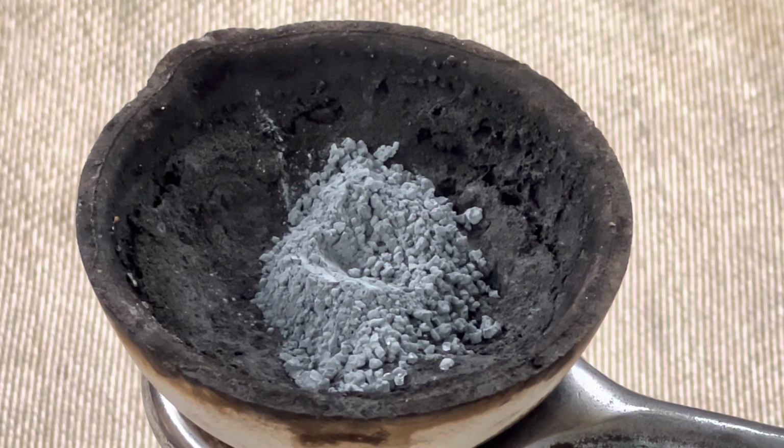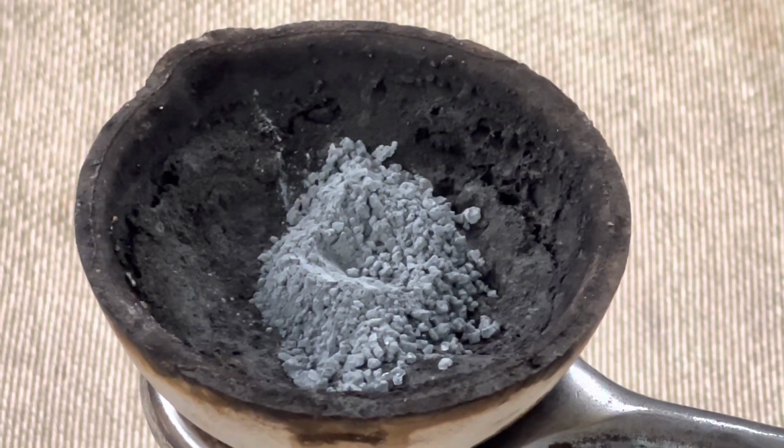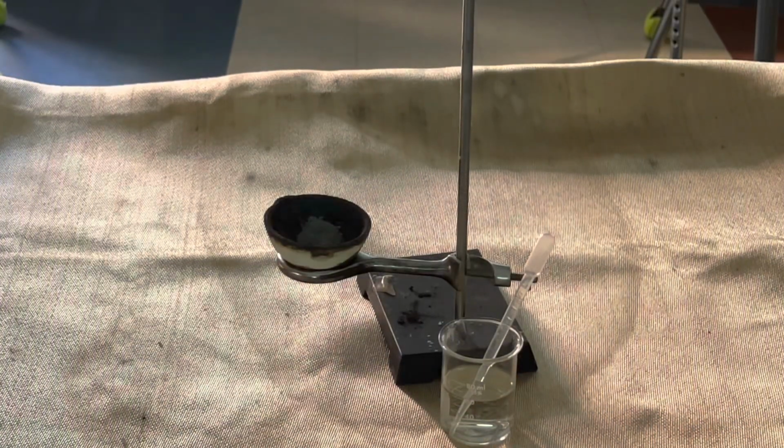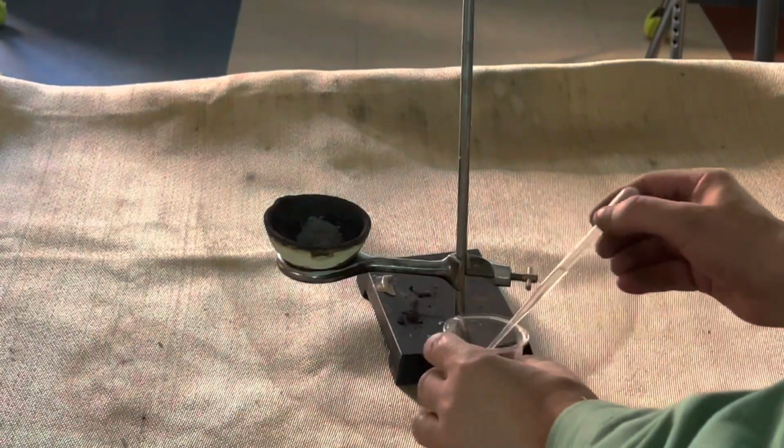This is an exothermic reaction. It's going to produce a fair amount of heat as that zinc is oxidized. Okay, now we're ready to add just a drop of water. Watch what happens.